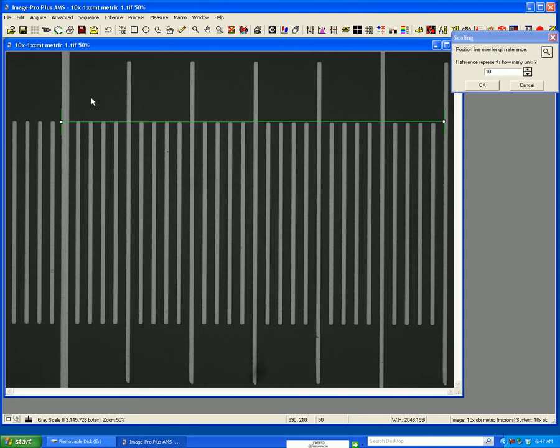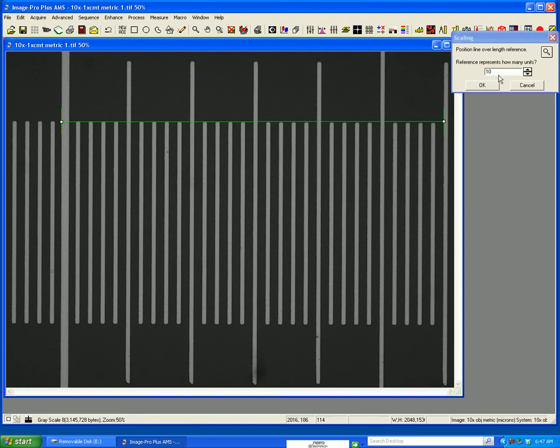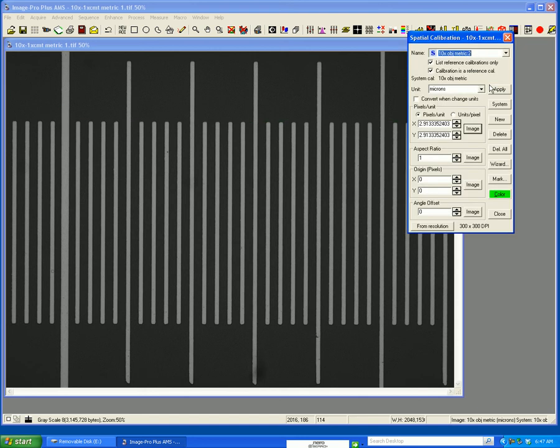Then I have to count. This is 100, 200, 300, 400, 500, 600. I'm going to say it's 600 units or microns and I'm going to apply it to the image.